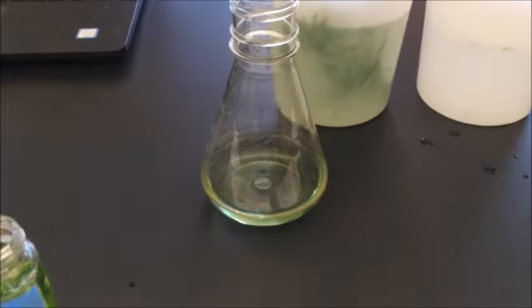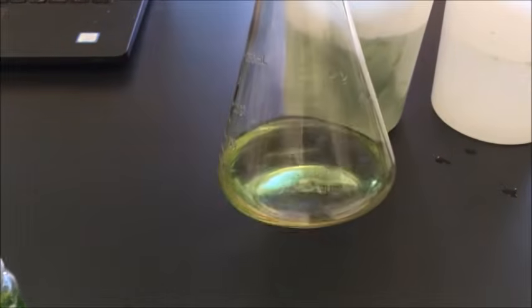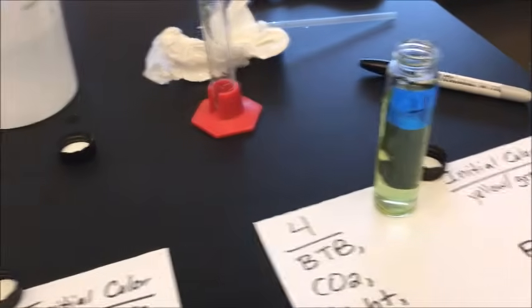Okay, I kind of did a lot off camera, so let me show you. Here's the flask that had the bromothymol blue plus my breath that I just blew the bubbles in. And I poured a lot of the bromothymol blue solution into these 4 tubes right here.